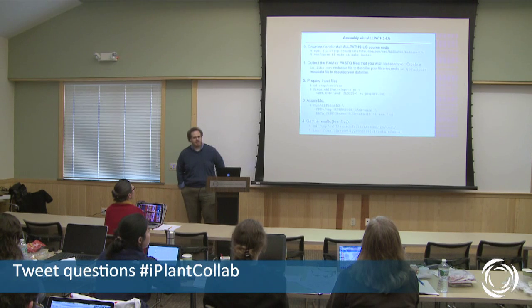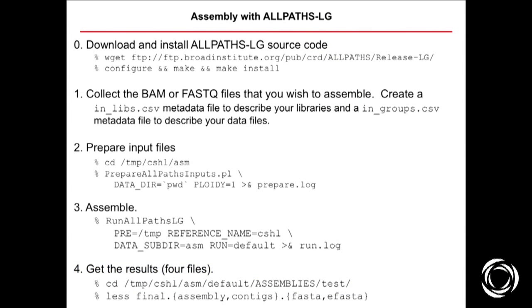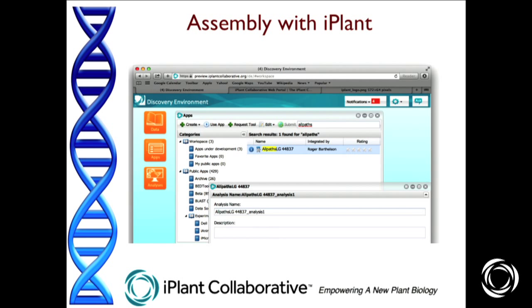Normally, I teach these technologies a lot. Normally I would start with, let's go to this FTP site, run all these complicated commands. But today we will not be doing any of those things, because we're going to use a discovery environment to do this in a very friendly, easy to use way.